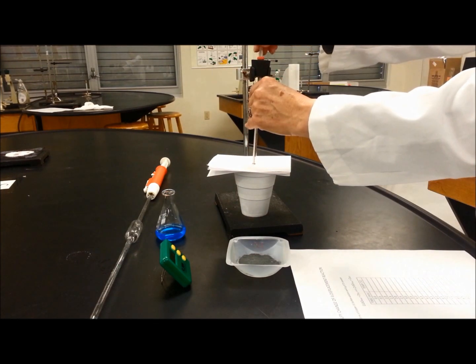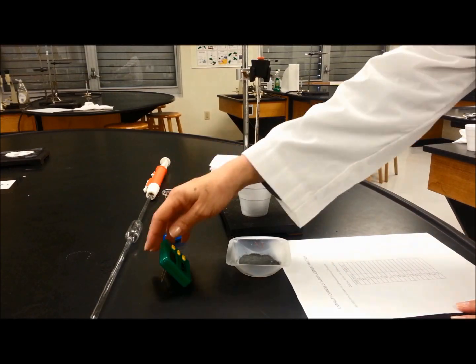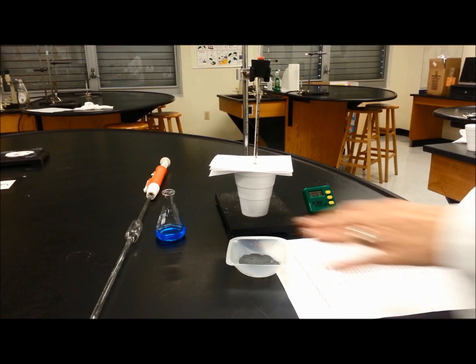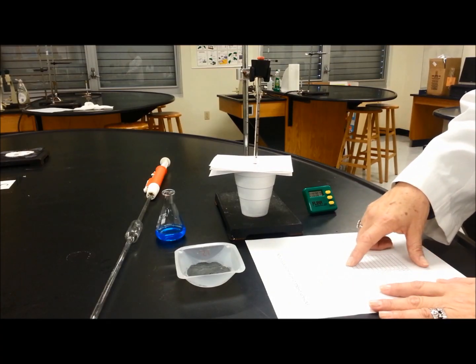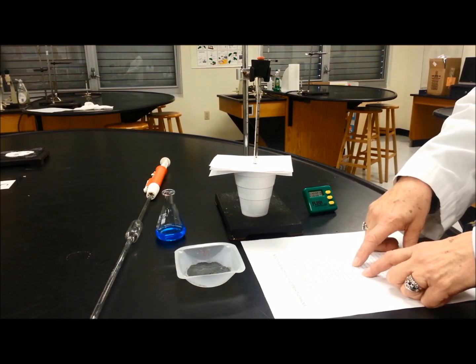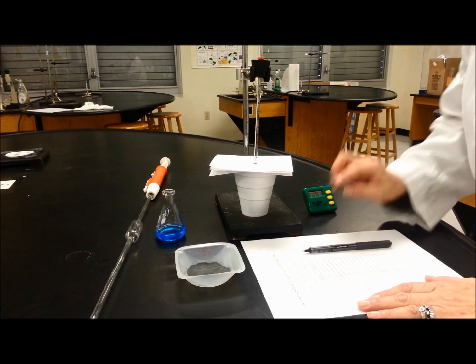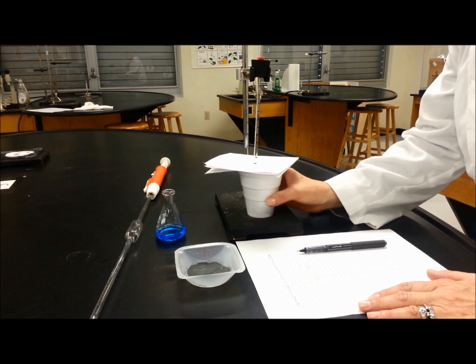We wait for the temperature to stabilize and begin recording. Every 30 seconds we record the temperature. When we get to 3 minutes, we do not record; instead, at exactly 3 minutes we add the zinc powder, skip that measurement, and then begin measuring again at 3.5 minutes and so on until 9 minutes. All the time when you are recording, you need to swirl so the temperature is evenly distributed in the liquid.